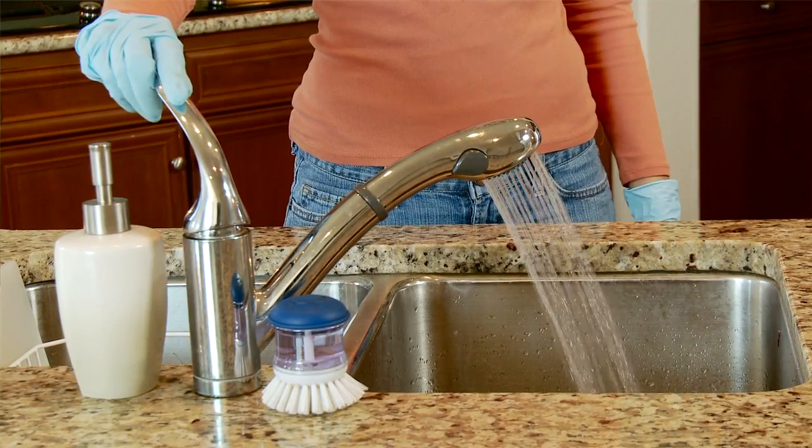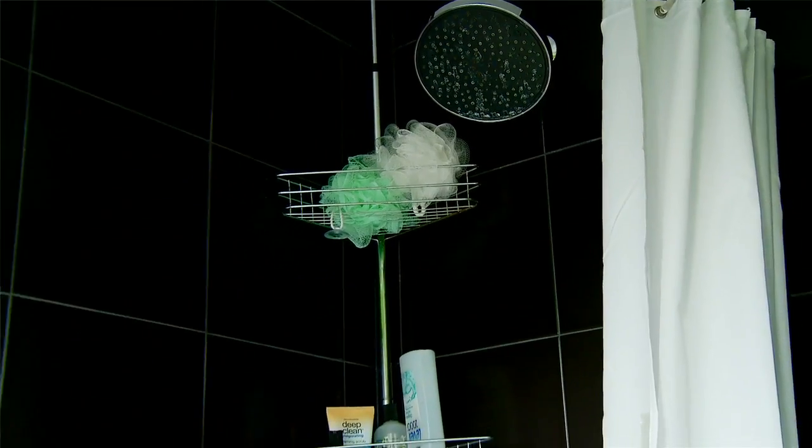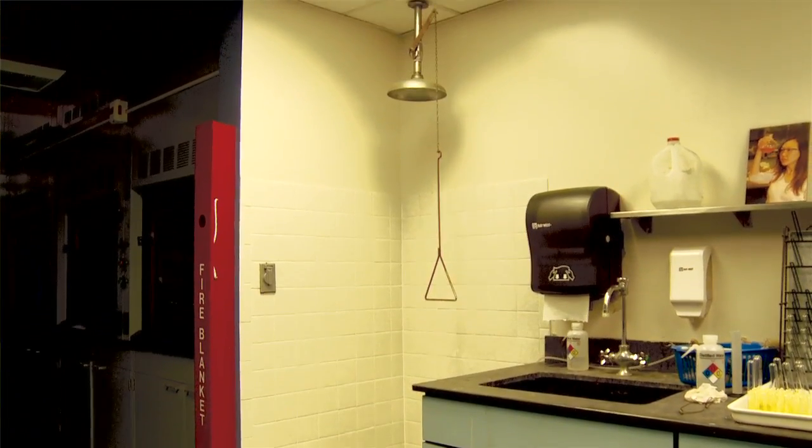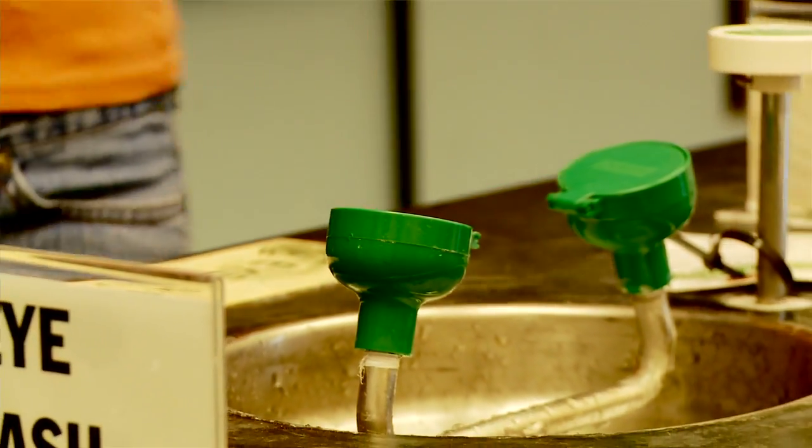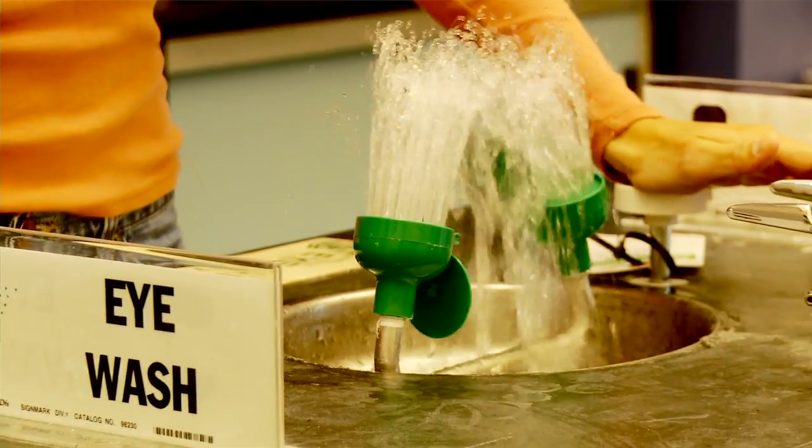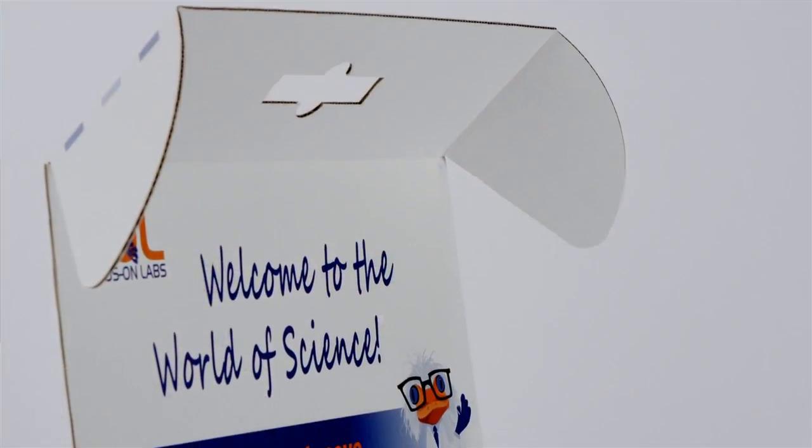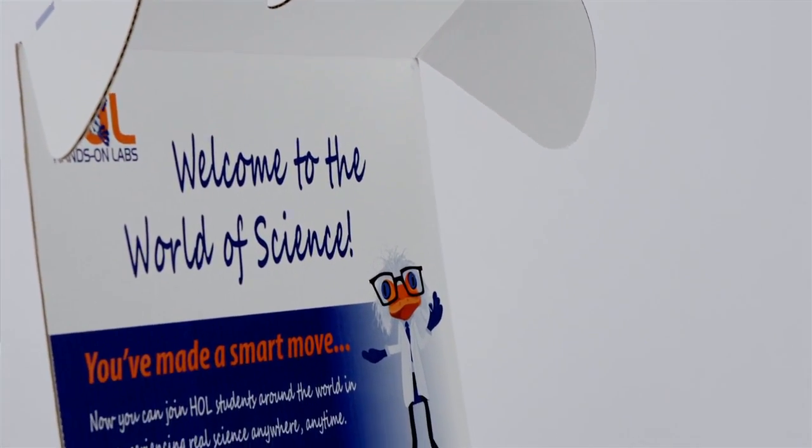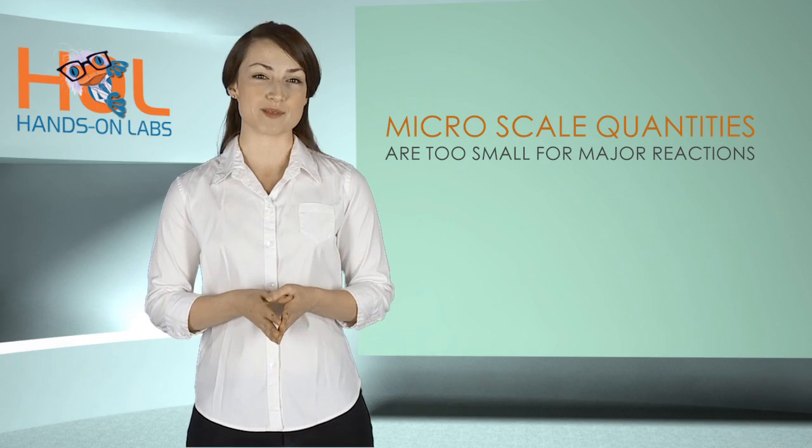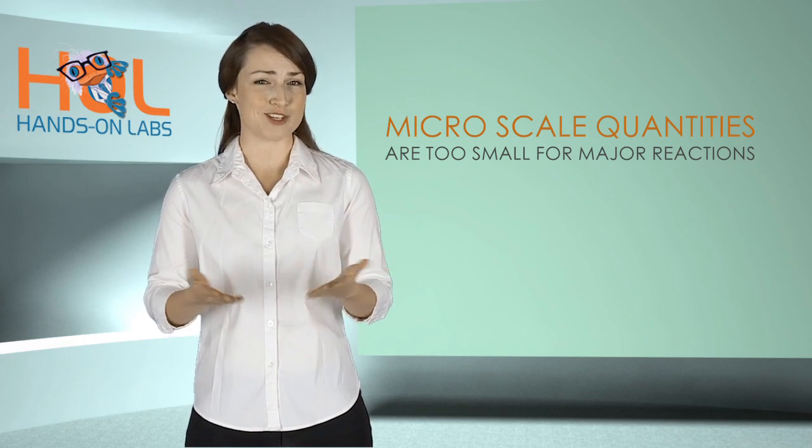Have some water available, either a sink, bottled water, or a bathroom shower nearby. In a campus lab, you'll find the safety shower and eye wash stations should you ever splash or spill chemicals on yourself or a fire starts. This is highly unlikely to happen since the micro scale quantities provided are too small for major reactions.